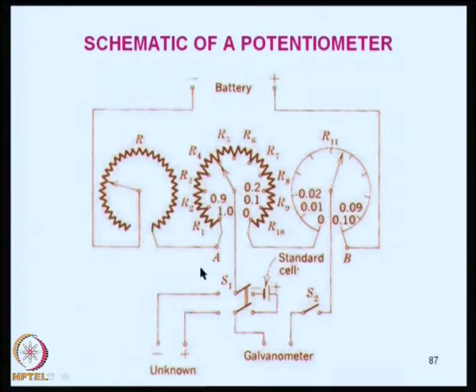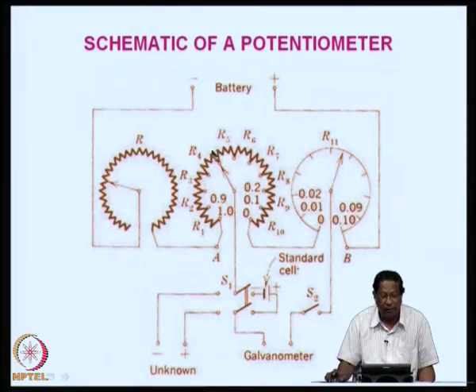So, the apparatus as such is not very difficult, but it is a very simple potentiometer what we had used in our previous discussions. This slide will show you a simple potentiometer. The resistances are adjusted to measure the slide wire, and then the battery is a source of supply. The solutions are kept here, and this is basically a galvanometer, and currents are measured as usual.